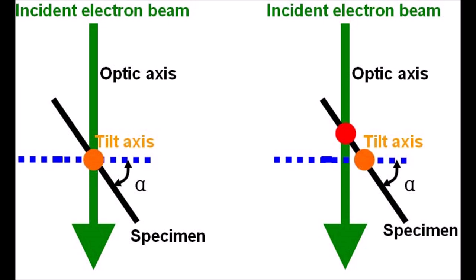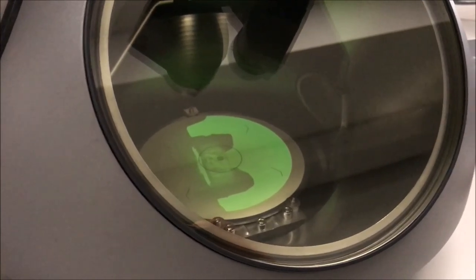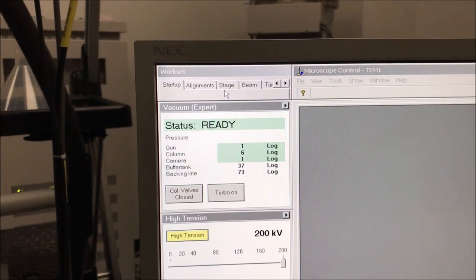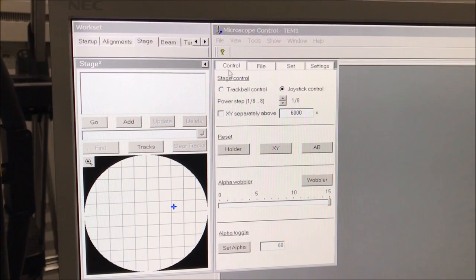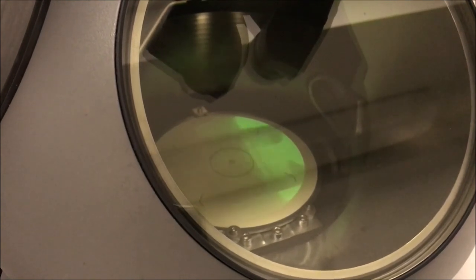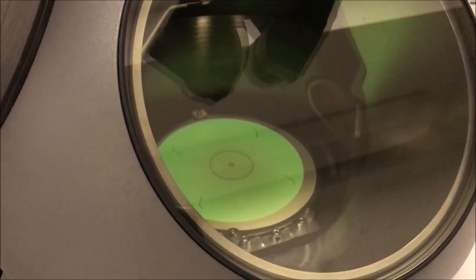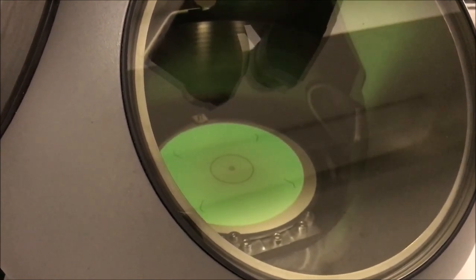Now we can move on to how to set eucentric height on your microscope. I have a FIB lamella here to demonstrate. I'll navigate to the stage tab and expand the flap-out arrow. Going down to alpha wobbler, I can turn on the wobbler, which wobbles the alpha tilt of the stage. If the sample is not at eucentric height, you'll see the image of the sample shifting as the alpha tilt is wobbled.